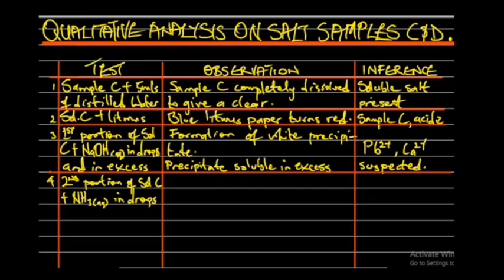We discovered that white precipitates were also formed. Then in excess aqueous ammonia, the substance was insoluble.